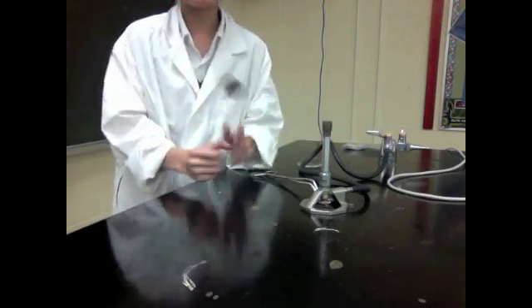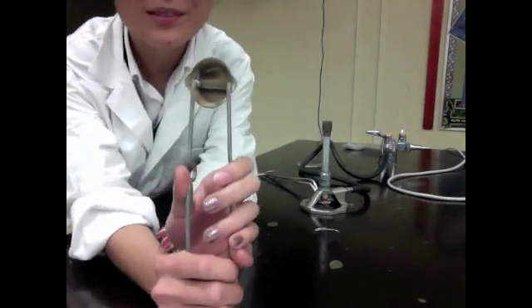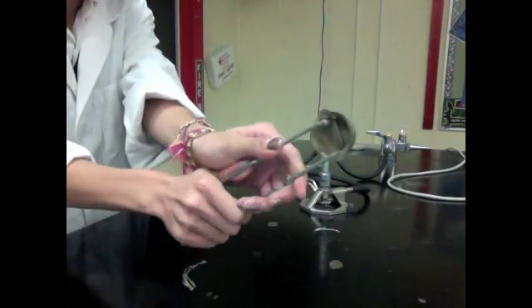You're also going to need a flint, which looks like this. And it's basically a spark. And this is used to light the Bunsen burner.